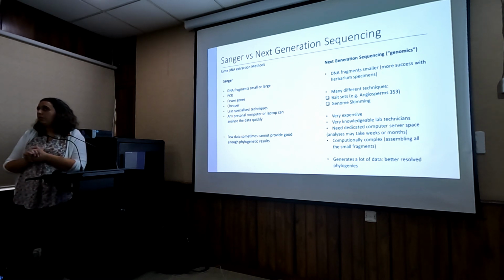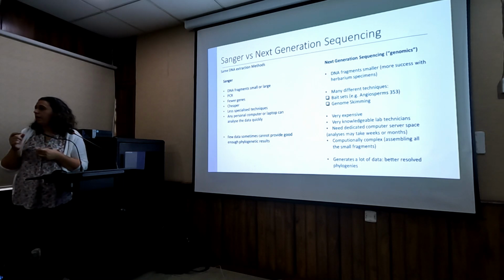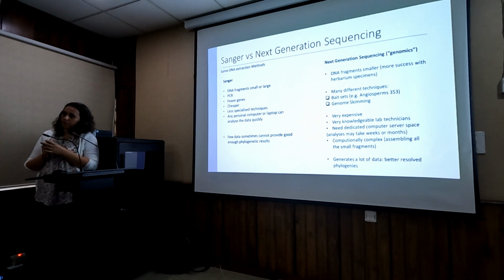So you have to know the length of your primers when you're using your bait sets on next generation, and know if your fragments are long enough that they will attach to the primer. So in our case, that's the good thing about next generation sequencing, is that you have lots of control steps, and you can check exactly how big your fragments are, and if they're too long, you can fragment them to a particular size. So you have a lot of control of how long your fragments are at the end, which with Sanger you don't. You just get what you get and you try to sequence it.